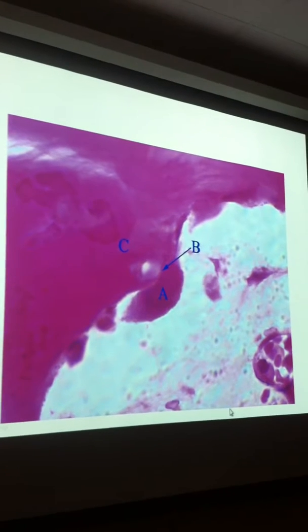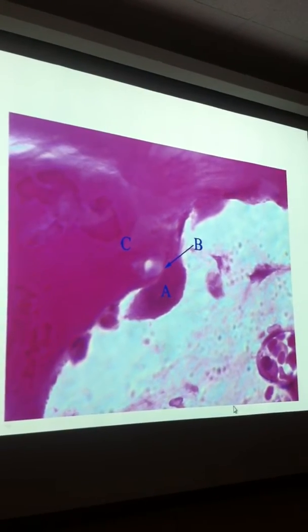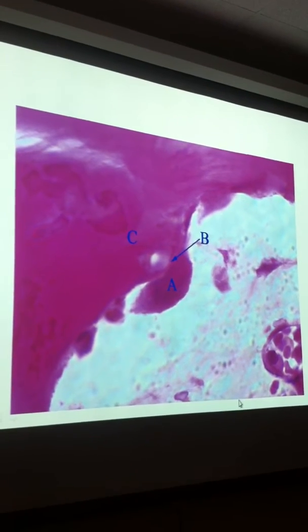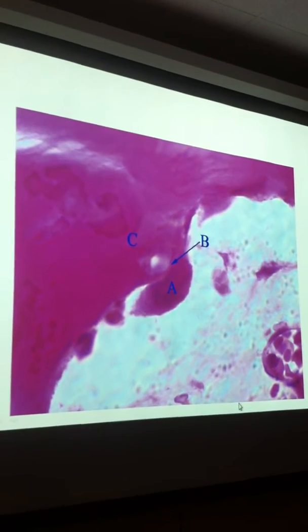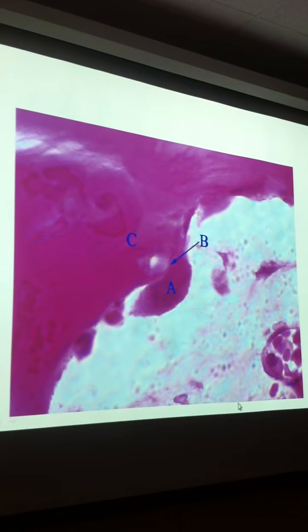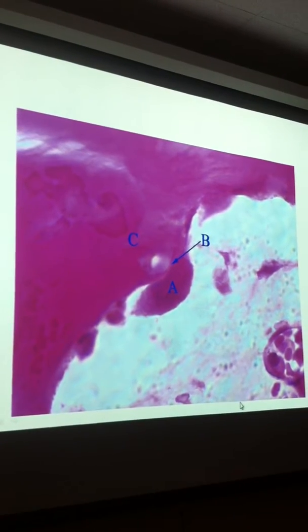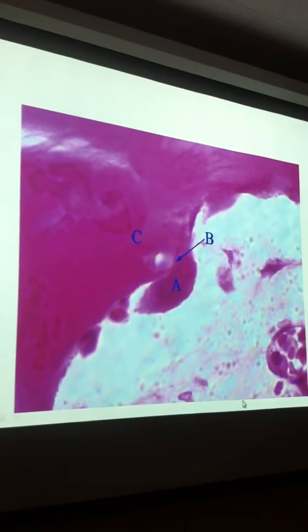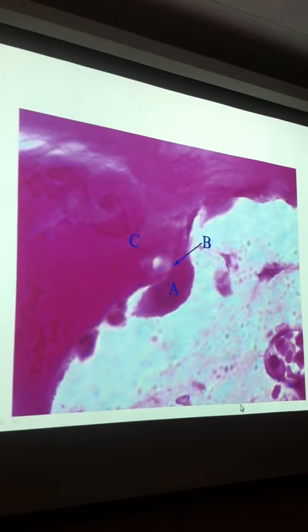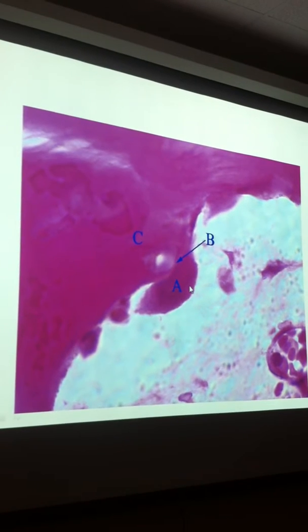So how about this one over here? The A cell. It's eating the bone. So chondroblast? If it's eating the bone, then it's an adipocyte, right? Osteoclast. Very good. Osteoclast. I don't know if you get to see the multiple nuclei. A little bit.